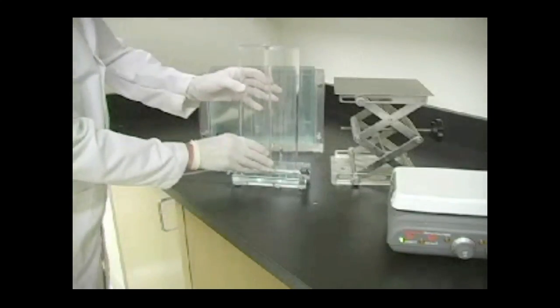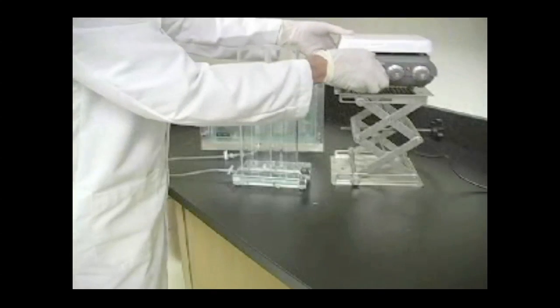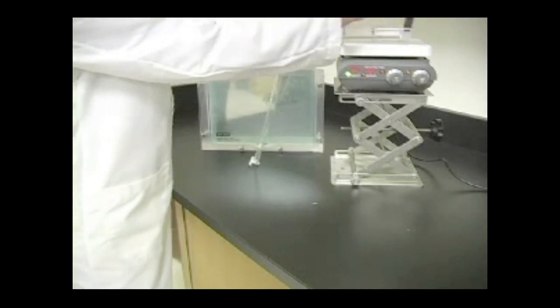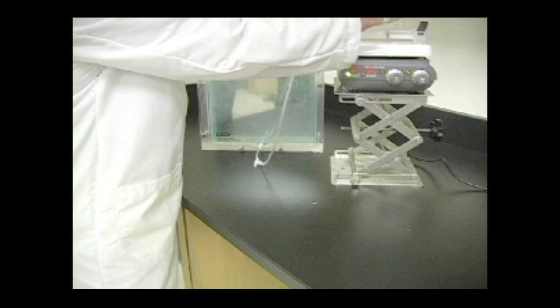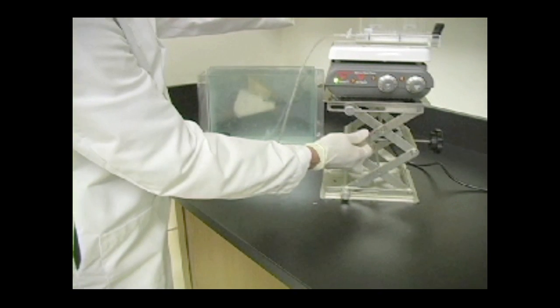Place a magnetic stir plate on a raised surface. Place the gradient former on top of the stir plate. Raise the level of the gradient former so that the bottom is above the top of the glass cassettes in the casting chamber.